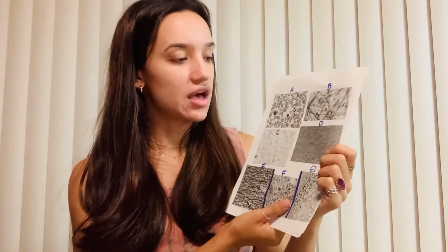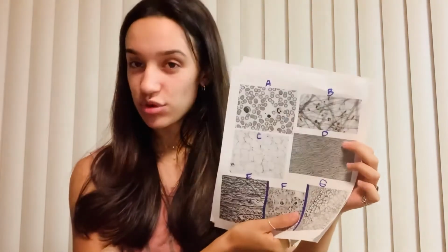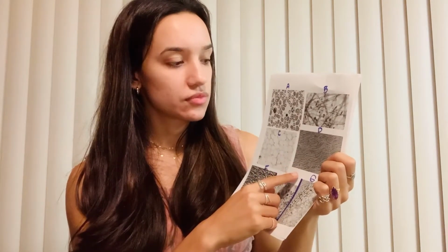It is found more so in adults who are in colder climates. Next, we have dense tissue, or rather fibrous tissue, and it is very dense, as you can see. This is made from fibroblasts and collagen, and it is found in different areas of the body.